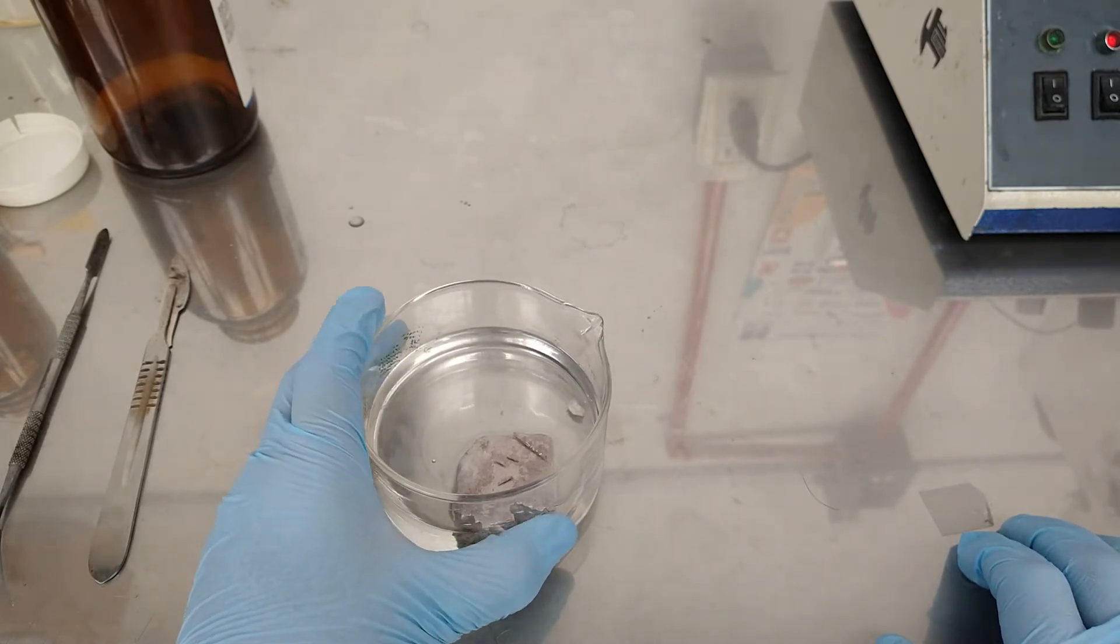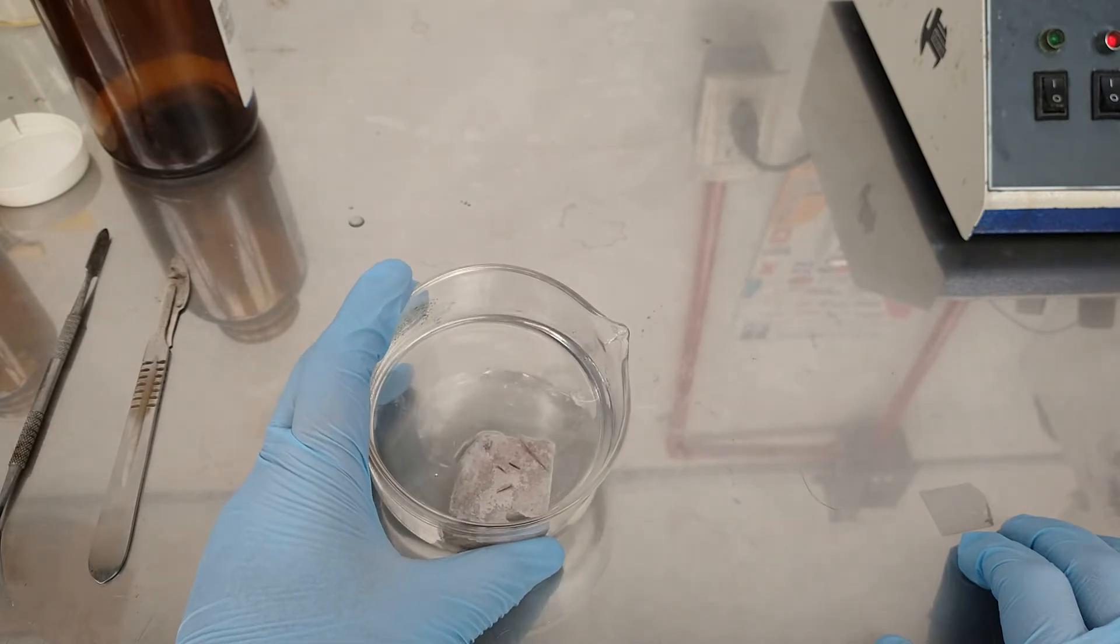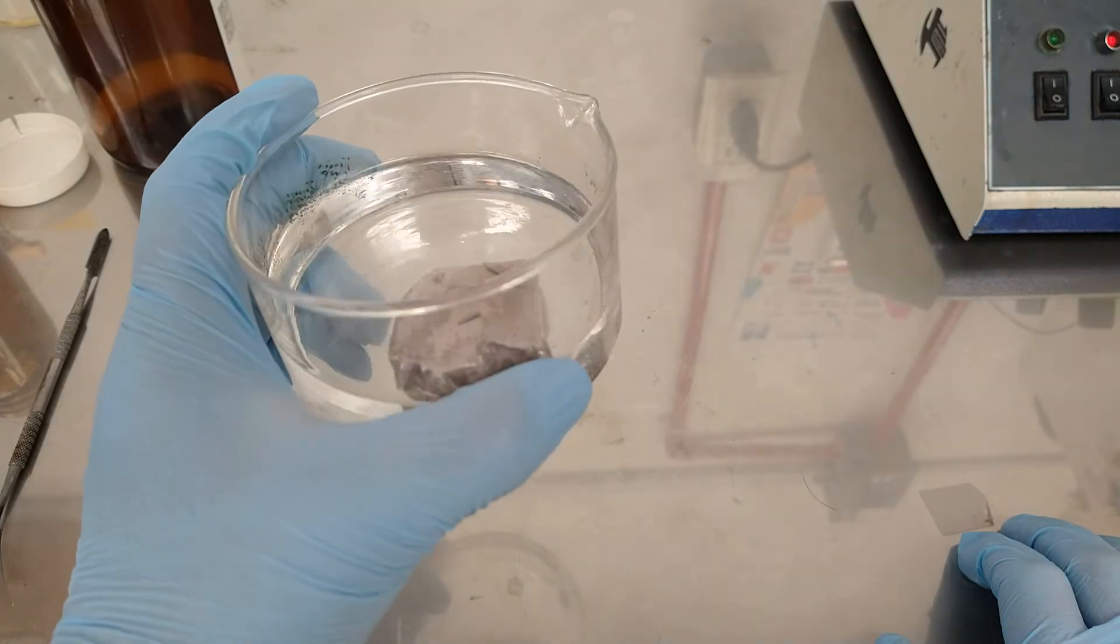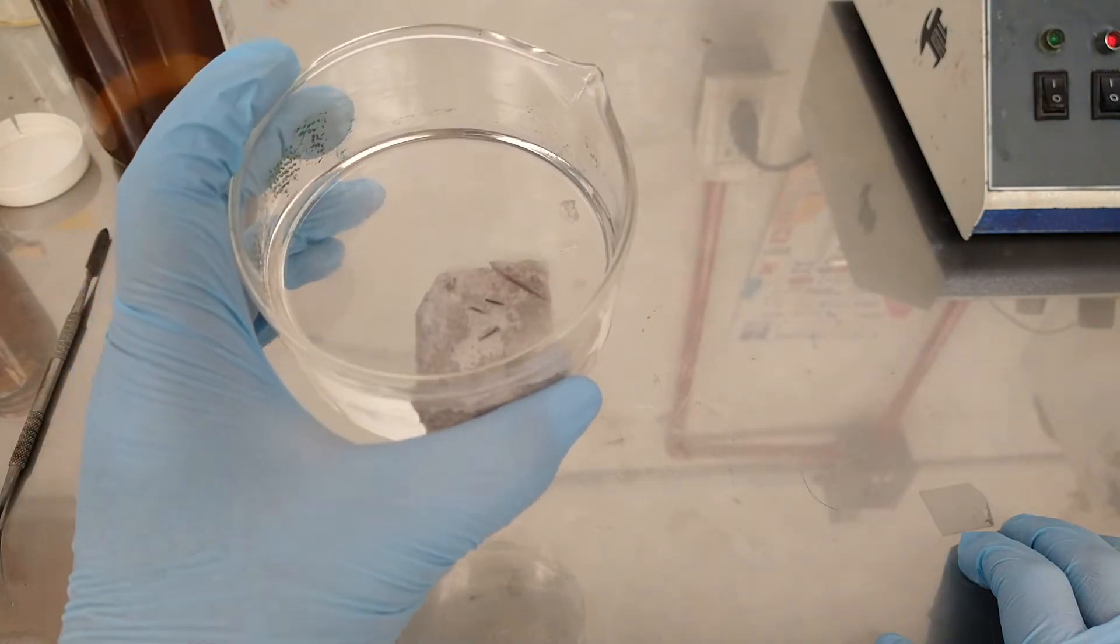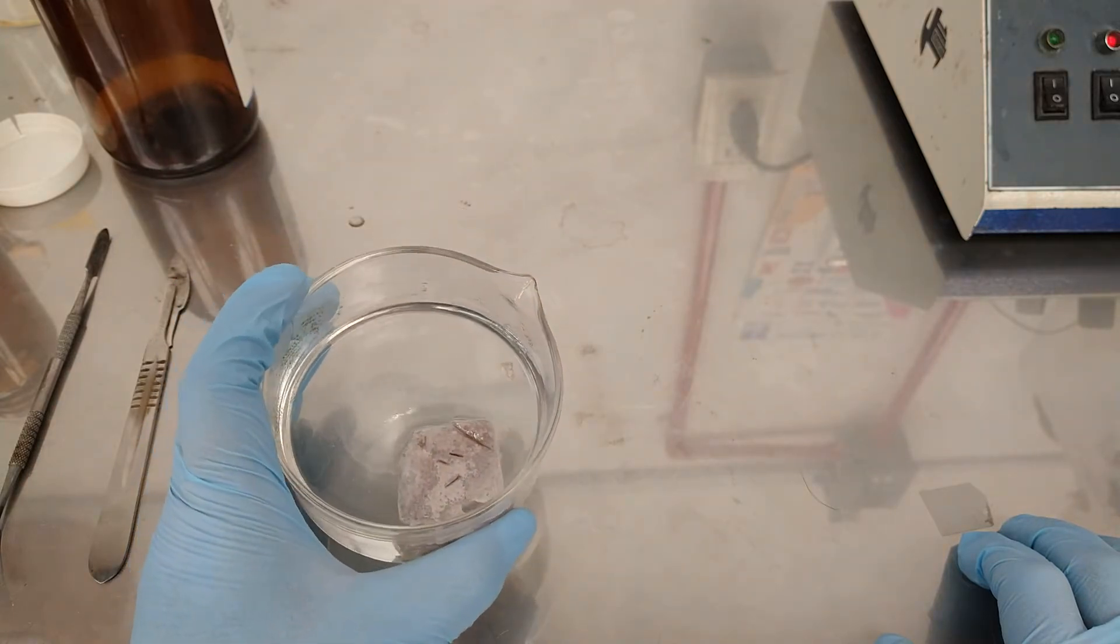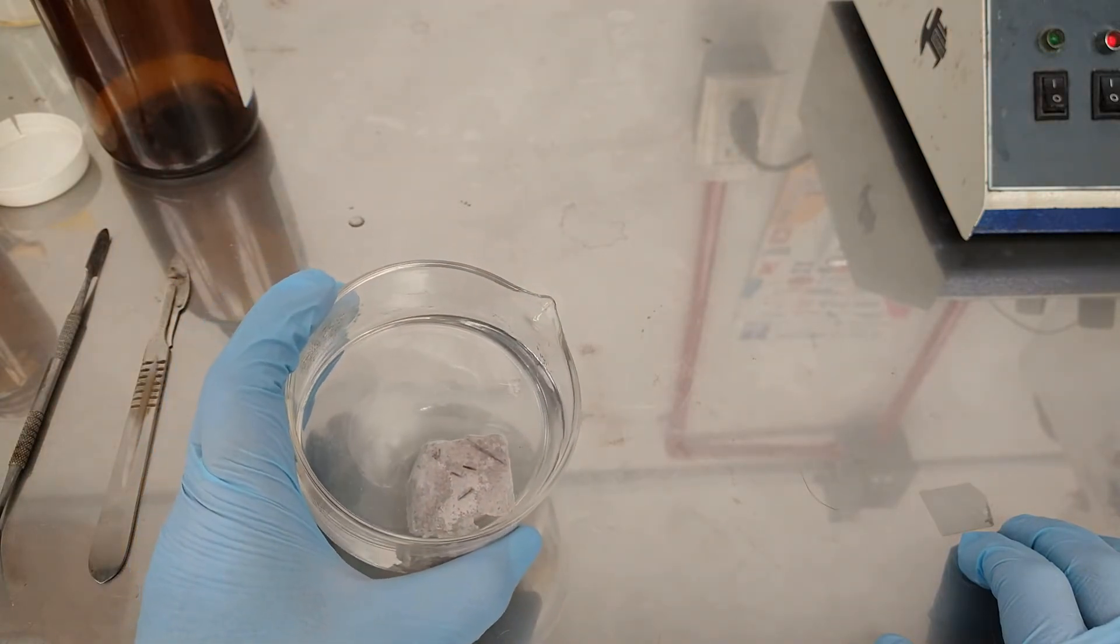For this reaction we need some sodium metal that is a little bit dirty, so we have to clean it first. We cut it and then clean it by melting it into hot mineral oil.